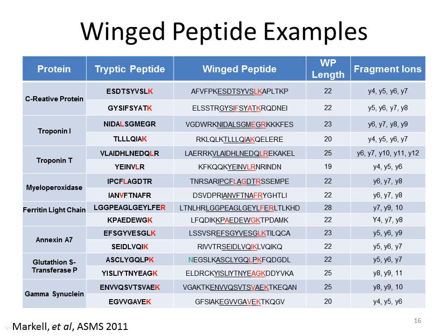And then we had these winged peptides synthesized that were differently labeled than the tryptic peptide. You can see the base tryptic sequence is underlined, and the heavy amino acids are shown in red, so that when we digested this and combined it with the tryptic peptide, we would get a different mass to charge and different product ions. I'm like 90% sure we also had the protein available for most of these. We called them winged peptides because of the wing things on the side, and we monitored 3 to 4 or 5 transitions per peptide.